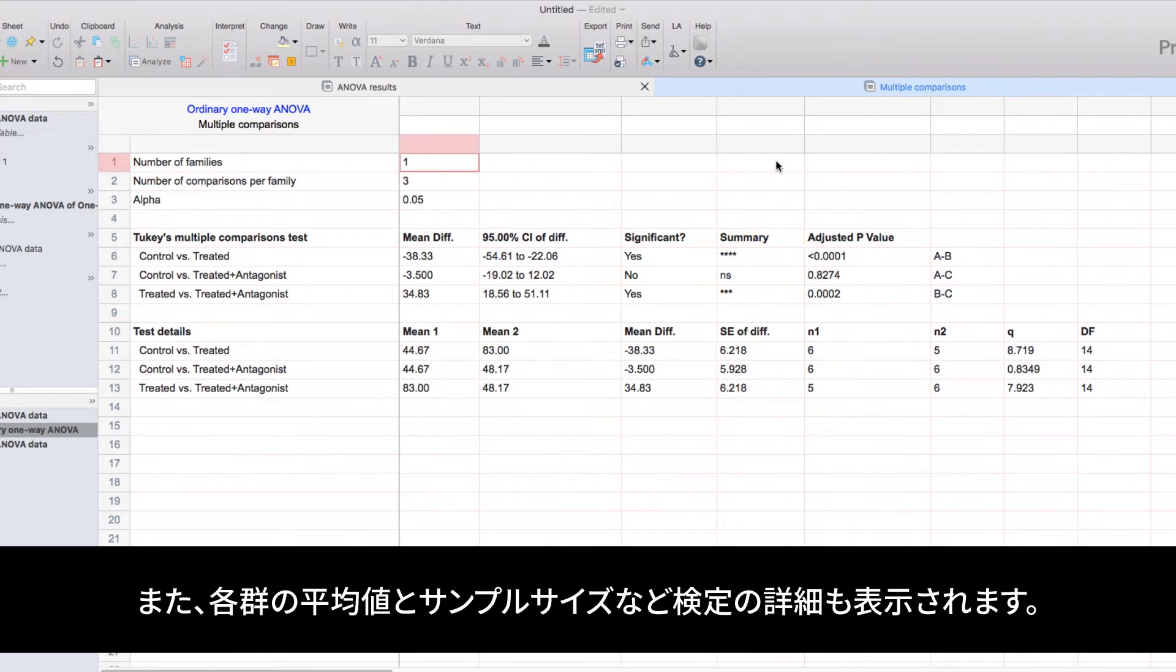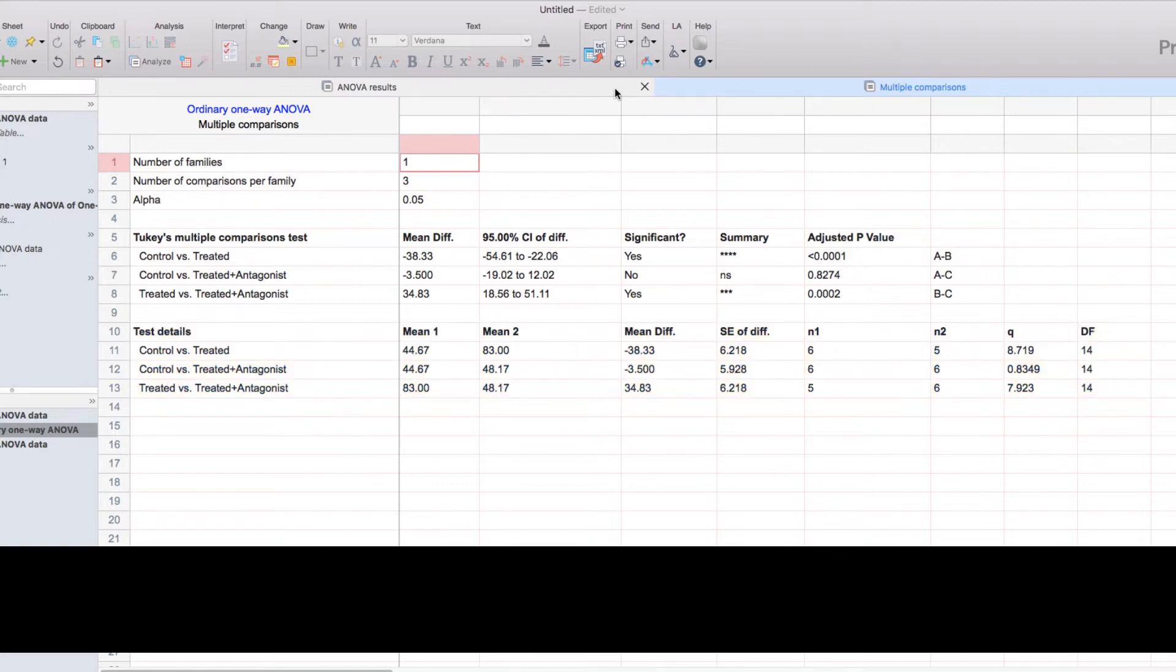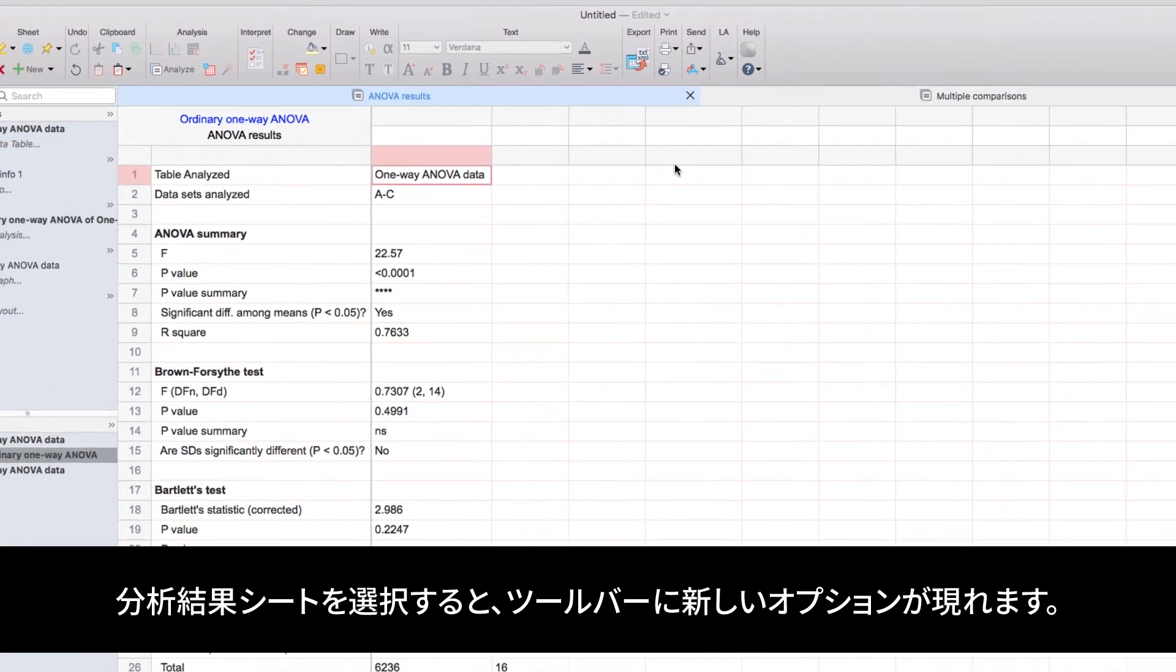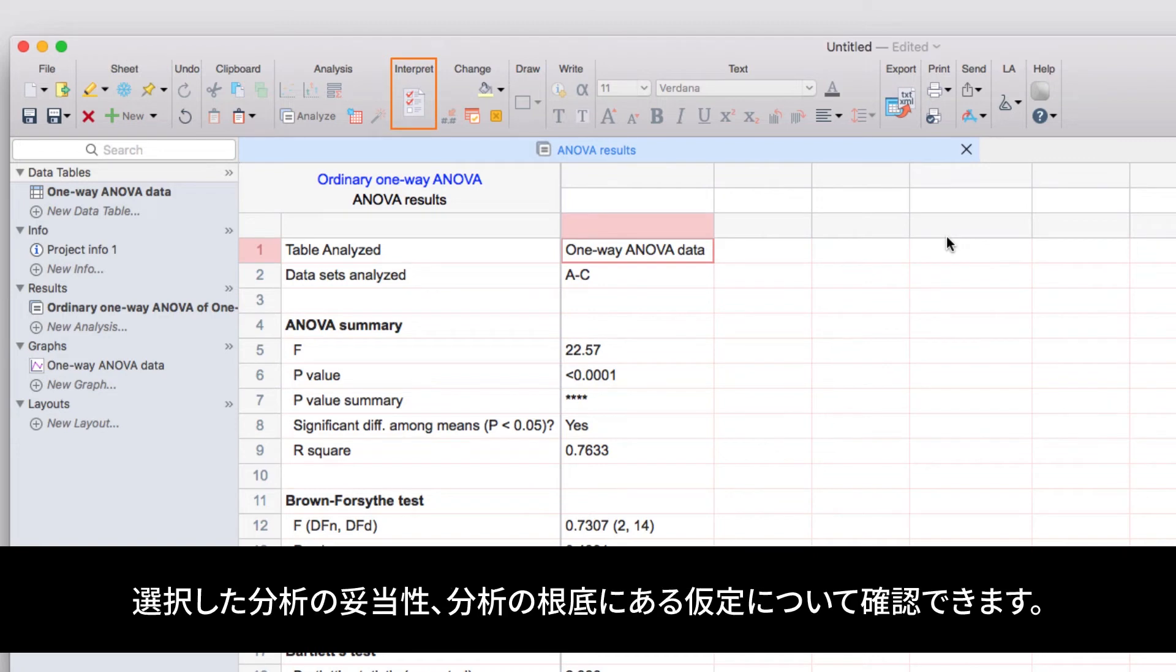In addition, we'll have the test details that indicate the average of each group as well as the sample size for each specific group. Importantly, when you're looking at an analysis results sheet, a new option will have appeared in the toolbar. The interpret button will take you to an analysis checklist online that helps ensure you made the right choice of analysis and will explain the underlying assumptions of the analysis that you chose.